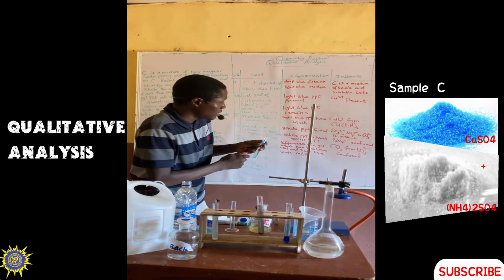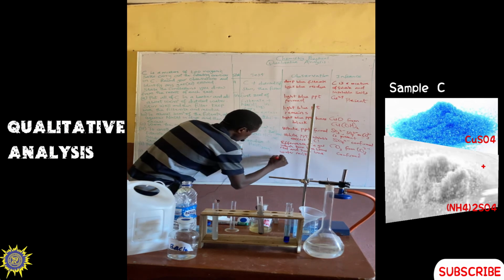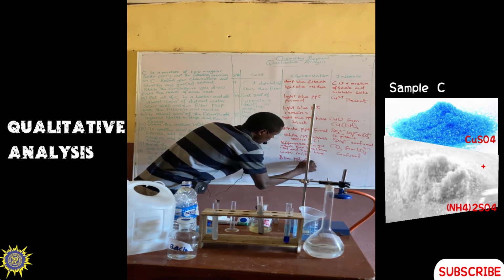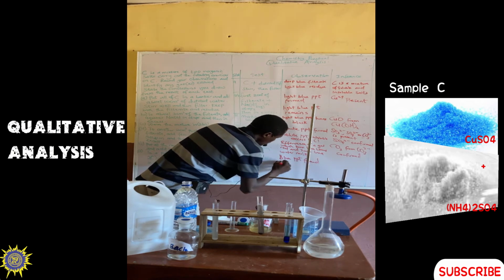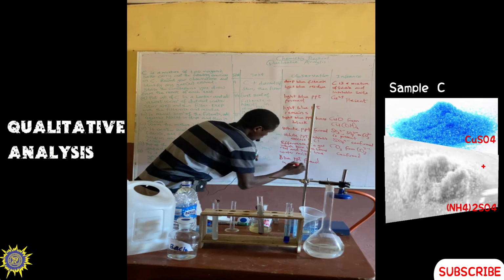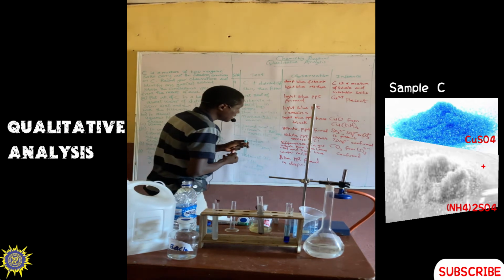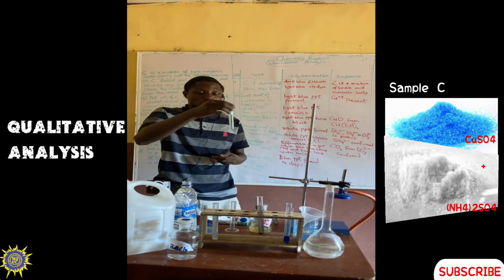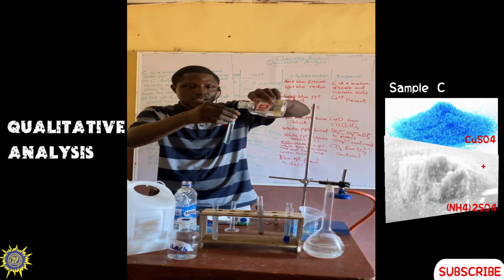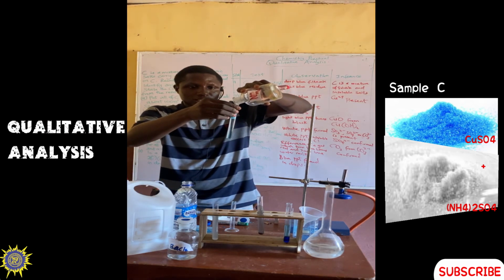So when they say in drops, the blue precipitate forms in what? In drops. Blue precipitate forms in drops. Then in excess, now let's see, if you want to add in excess, let's see.